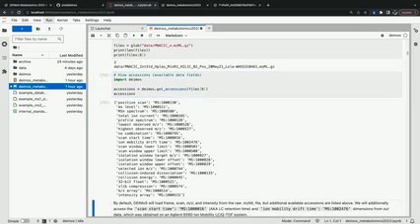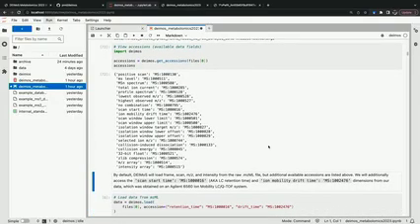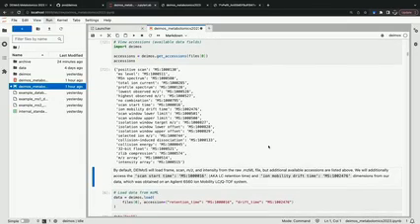So we'll import DEIMoS and use DEIMoS to read the accessions in the mzML file. And for those of you who aren't familiar with the mzML format, it's essentially stored in an XML-like format where it shows you all the different fields that are accessible in that data. And so here you can see the different fields that you can access, including the MS level, the ion current, et cetera.